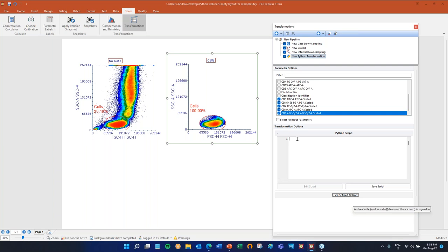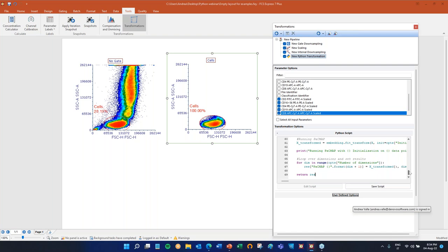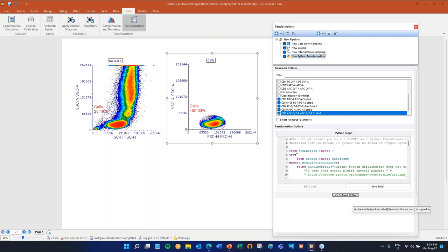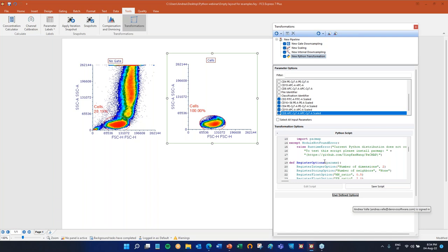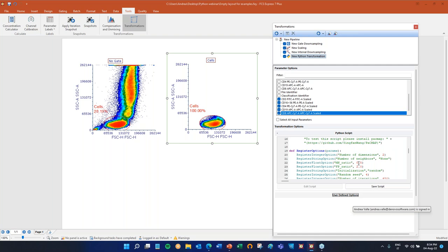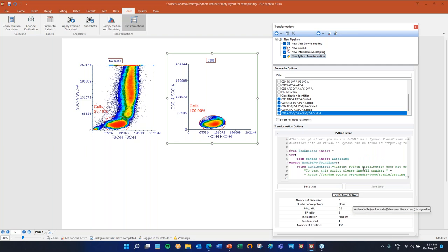Here you need to clear the example script — right click and Clear Script. Now paste using Ctrl+V, not right-click paste. Two things to keep in mind: remember indentation is really crucial, so you cannot paste wherever you want — paste at the first line, first position. Now the script is here. FCS Express is smart enough to automatically detect which words are functions and label them in purple, making the script more readable. FCS Express-specific functions are in blue and numbers are in red.